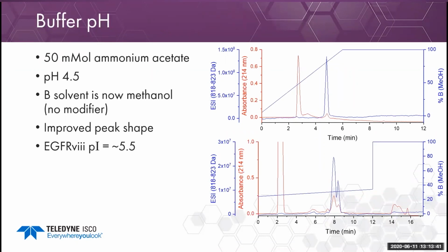Ammonium acetate is soluble in the presence of methanol, but not acetonitrile. The focus gradient generator worked first time in this run. However, we still see multiple peaks in the UV and the mass spectrometer.